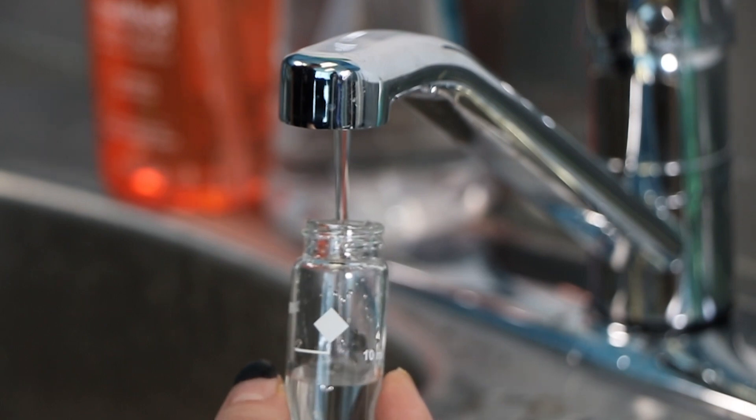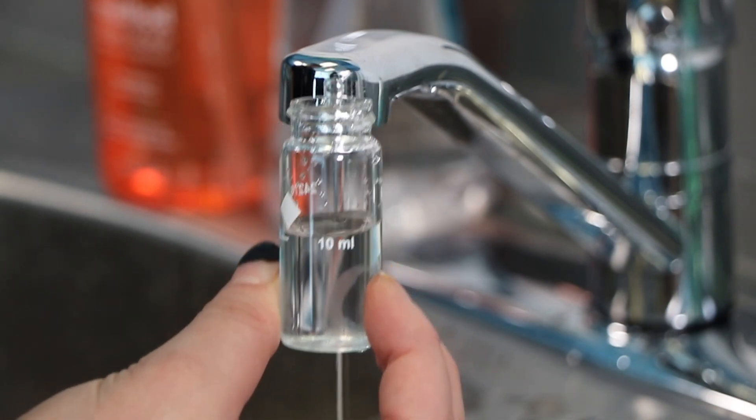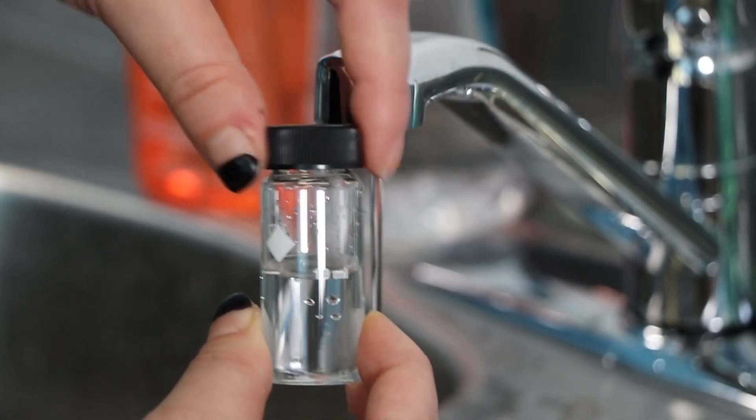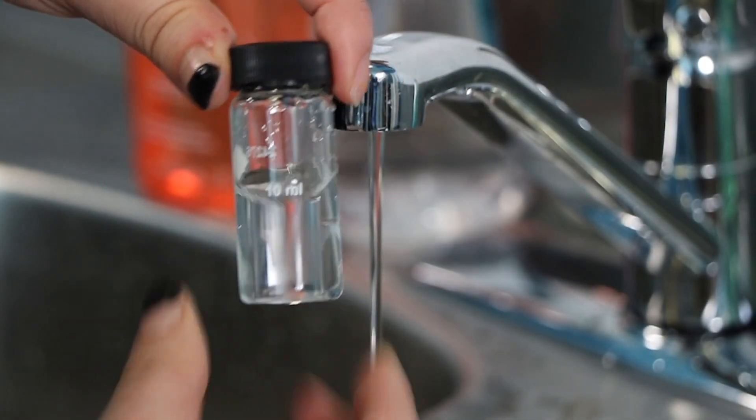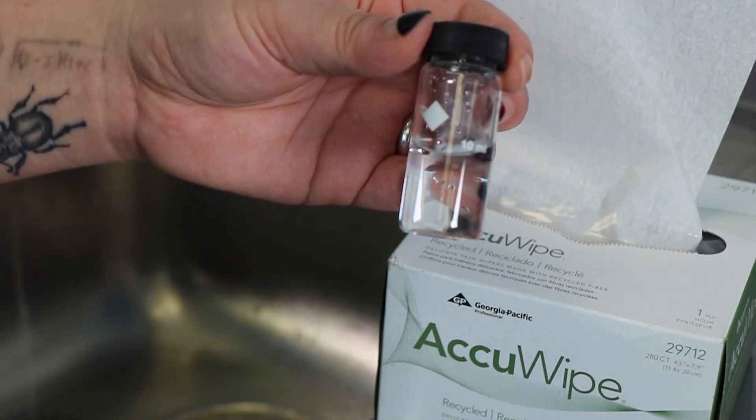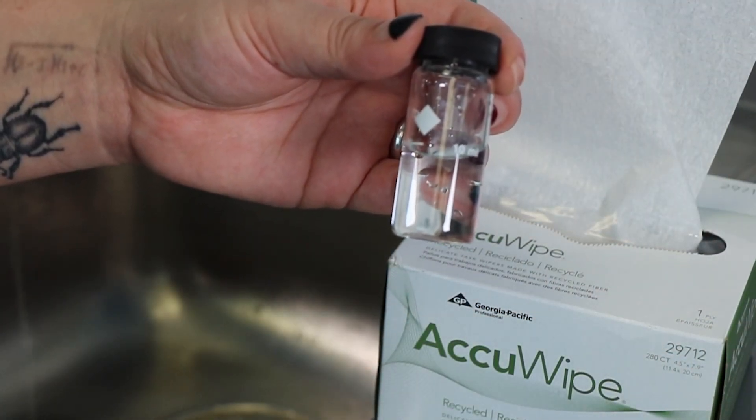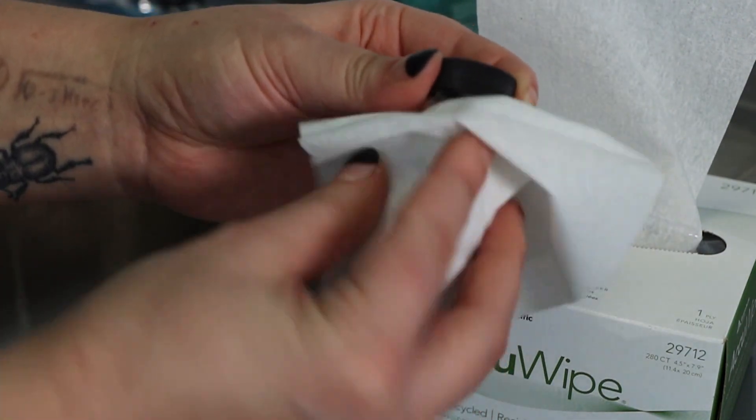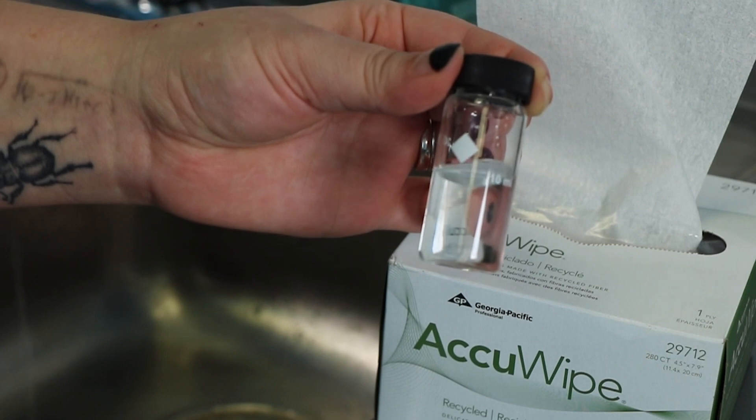Fill the sample cell, also called a vial, to the 10 mL mark and put on the cap. Carefully dry the outside of the sample vial with a lint-free cloth or tissue like an AccuWipe to remove fingerprints and any traces of liquid. Here's a tip: be careful not to scratch the outside of the sample vial as this can affect the reading.